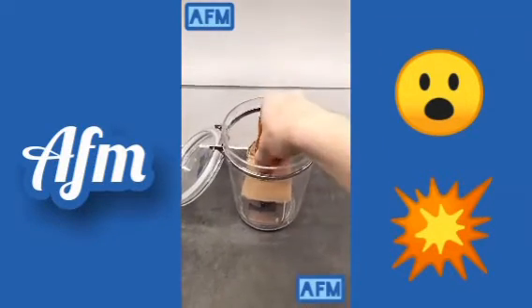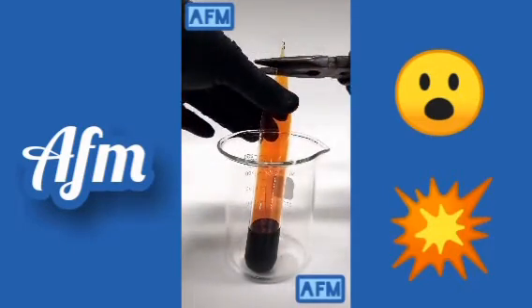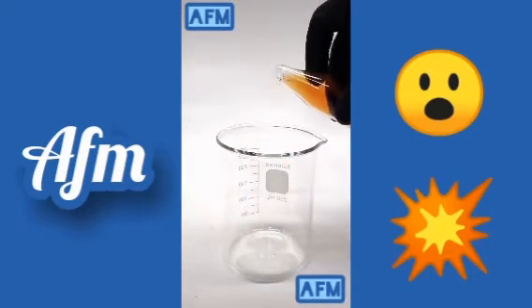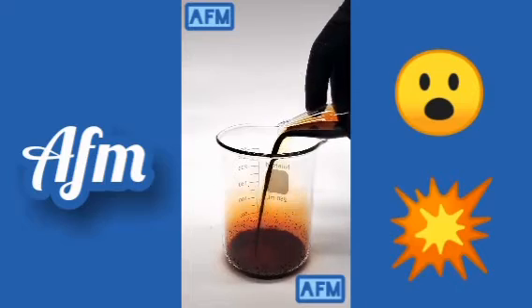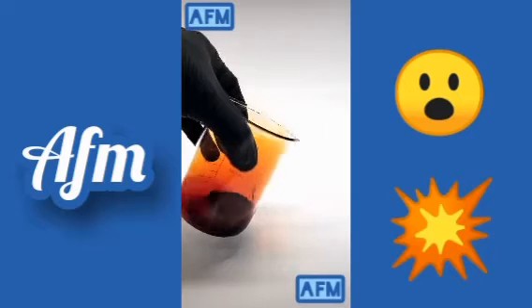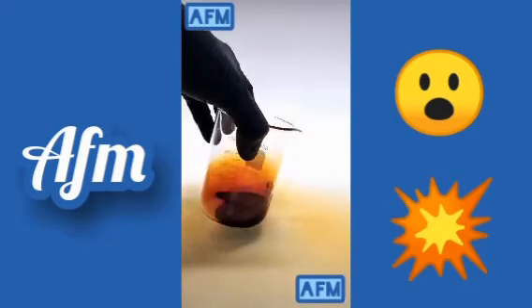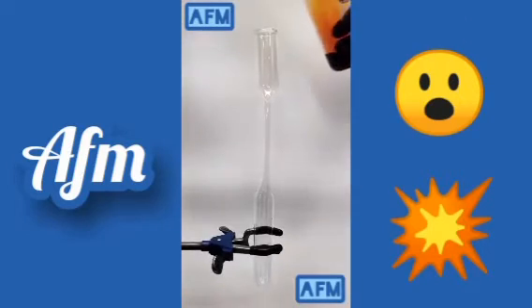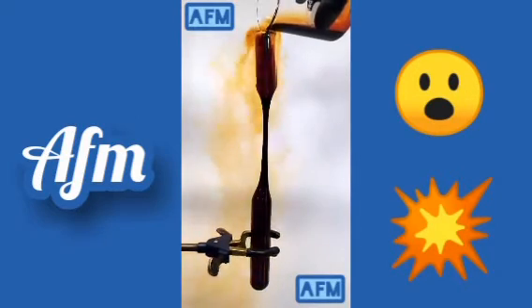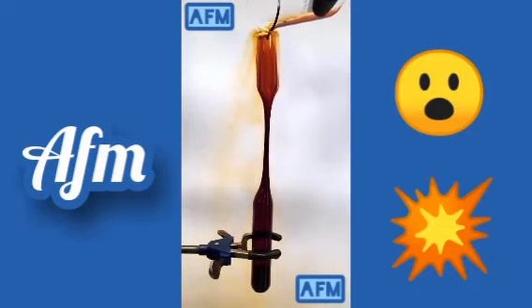This is bromine. It's chemically very similar to chlorine, except chlorine's a gas and bromine's a liquid. It also lets off a lot of nasty orange vapor, and this is why I sealed it in glass. Bromine's really dense, and it's more than 3 times as dense as water, and this makes its vapor really heavy. Bromine's notoriously difficult to store, and if I just put it all back into a bottle or something, it would damage everything around it. So I have to seal it again in a glass ampule that I made from a test tube.